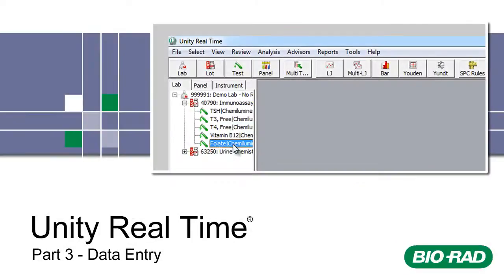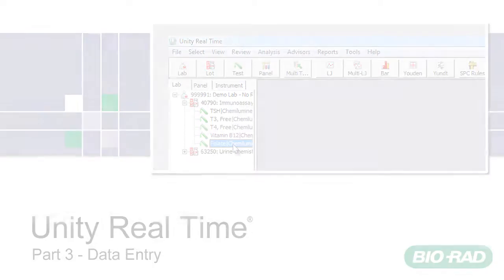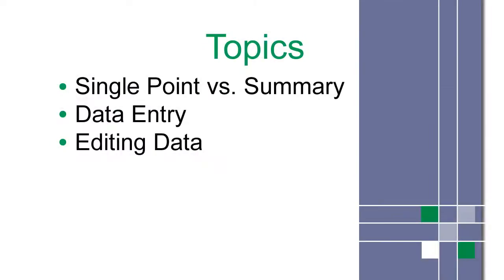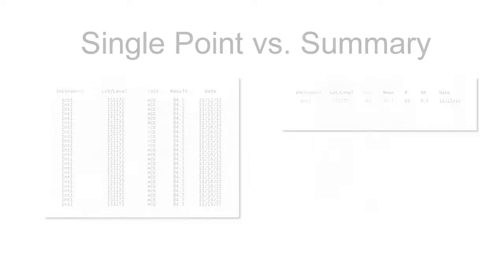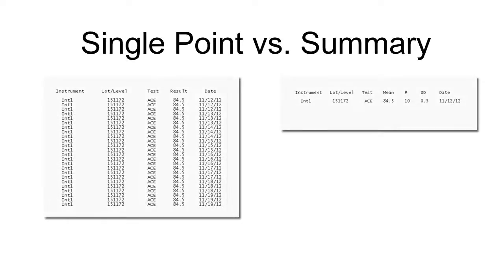Welcome to Unity real-time training part 3. This is a list of topics covered in this video. Some customers use a connectivity solution while others enter their data manually. This tutorial focuses on the latter. There are two methods for data entry.